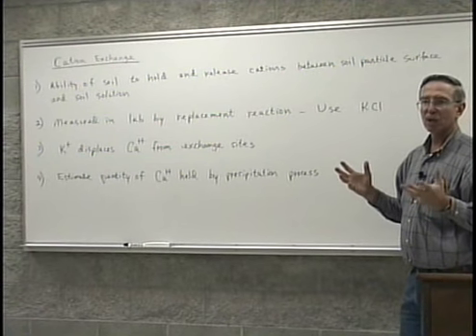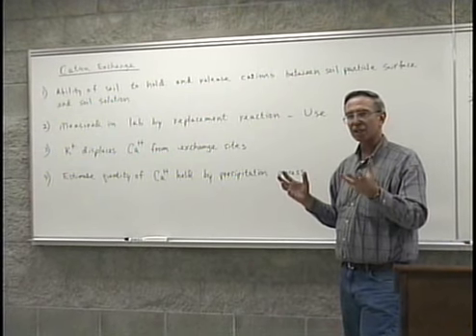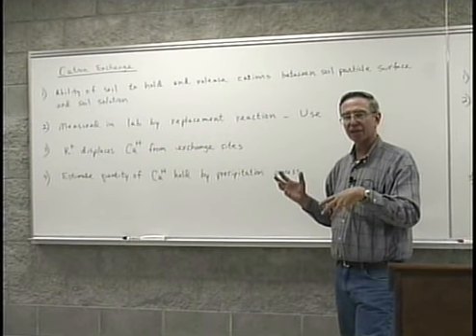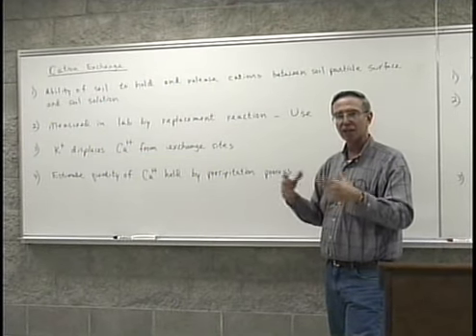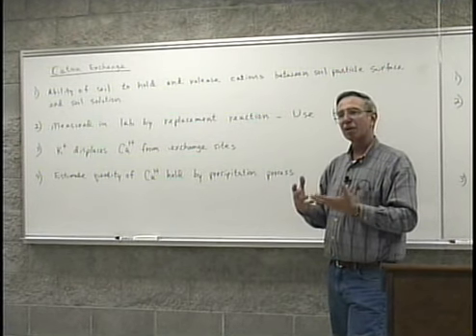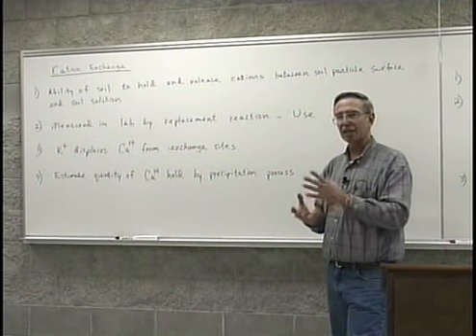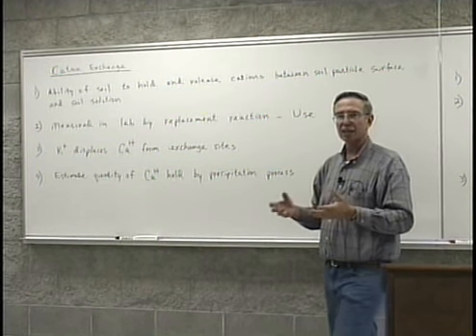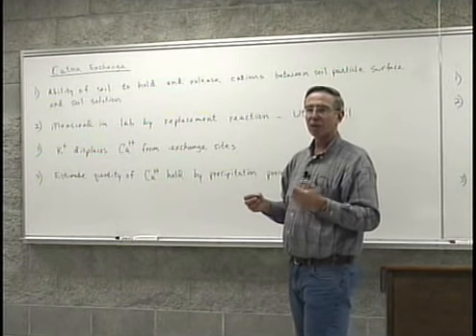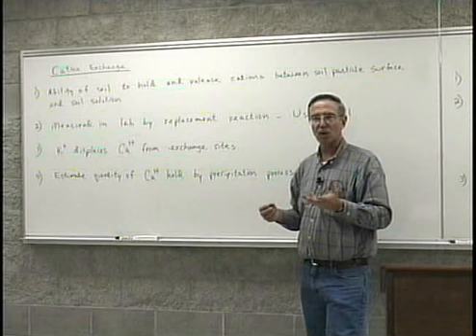In other words, we will be, in one case, utilizing distilled water, which does not have a concentration of ions in it. It's distilled or deionized. We will be leaching a soil sample with this. The purpose of that is to remove any soluble calcium which occurs in that soil and get it into the leachate. In the second soil sample, we will be leaching that soil with a concentrated solution of potassium chloride.